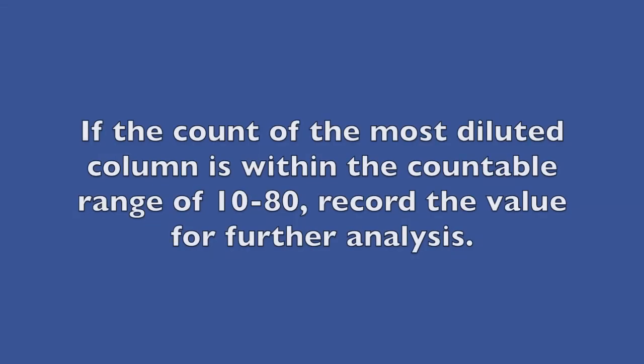If the count of the most diluted column is within the countable range which is best between 10 and 80 colonies, record this value for further analysis.